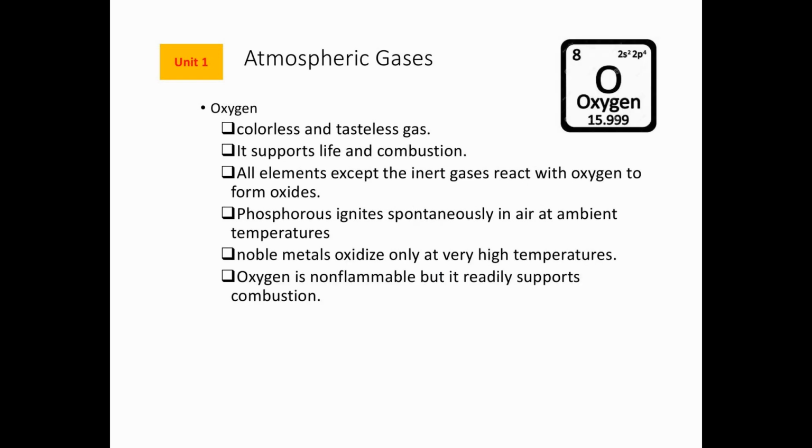Oxygen is an oxidizer. It's colorless and tasteless, but it supports life and combustion. If the oxygen falls below a certain concentration level, it produces a life-threatening situation. As we saw in the previous table, oxygen is roughly 21%. You should have a life safety system in your laboratory to monitor the oxygen level if you're dealing with bulk gas analysis.